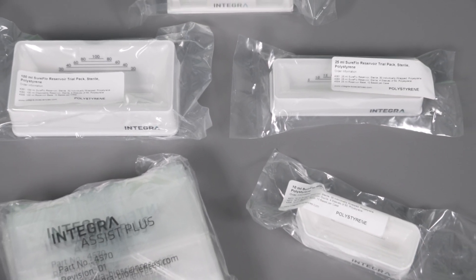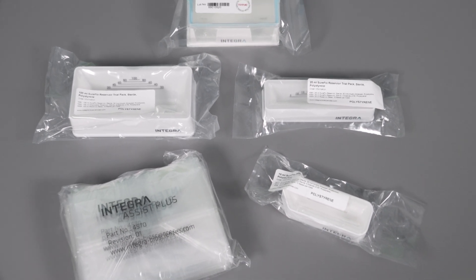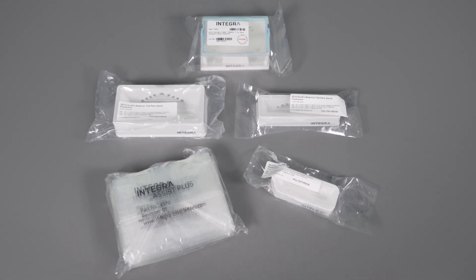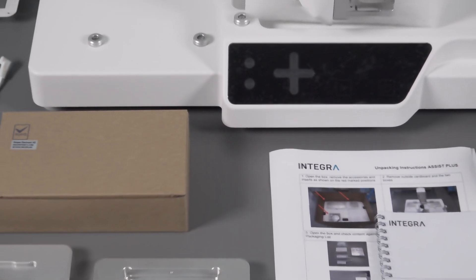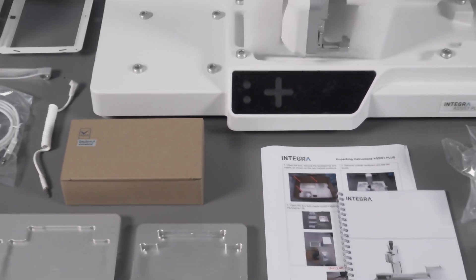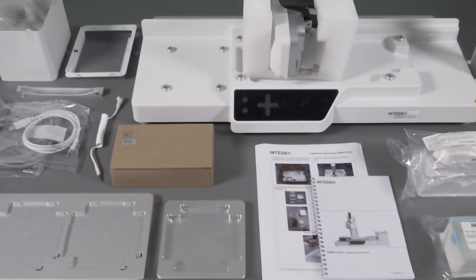The other accessory box contains four reservoir trial packs in different volumes and bags for the waste bin. As a brief summary, here's an overview about all items which are delivered with an Assist Plus base unit.